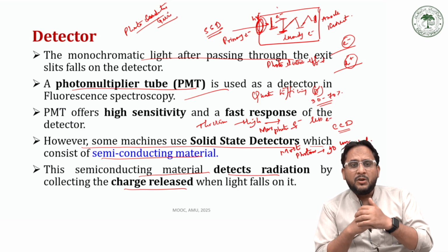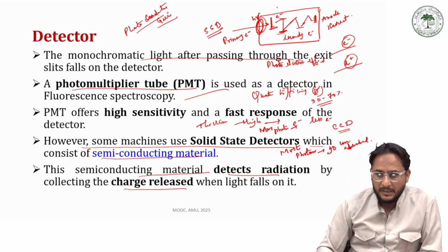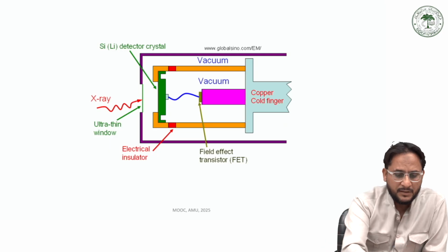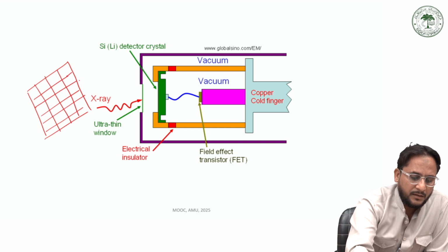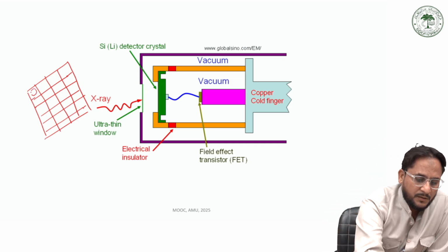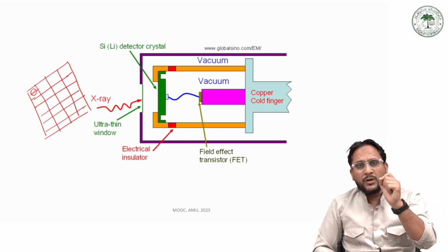They are capable of detecting multiple elements at a time, because these solid state array detectors have a plate on which there are different light sensitive materials arranged in an array, and each square of these light sensitive materials is able to detect one material.